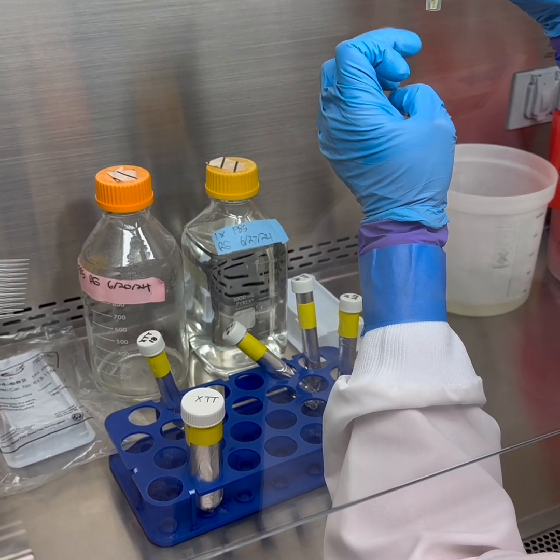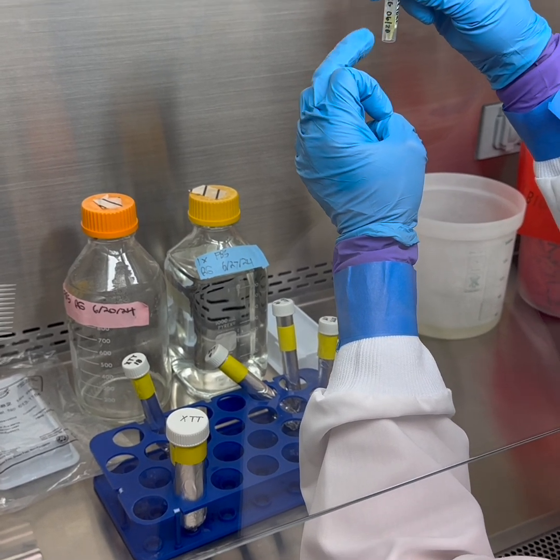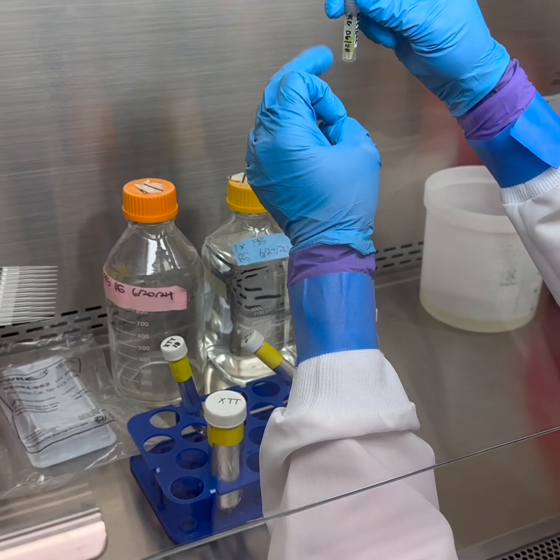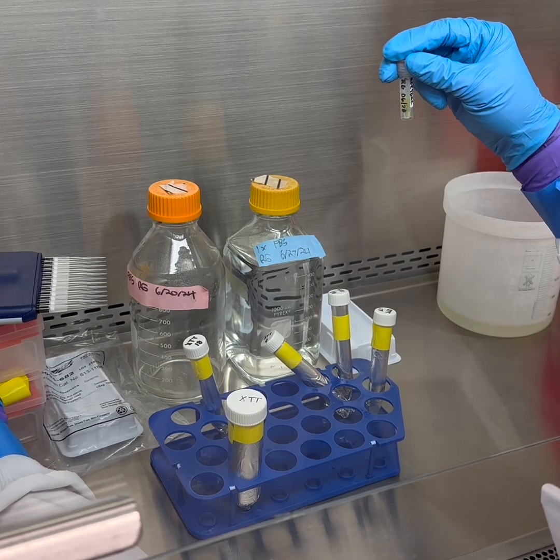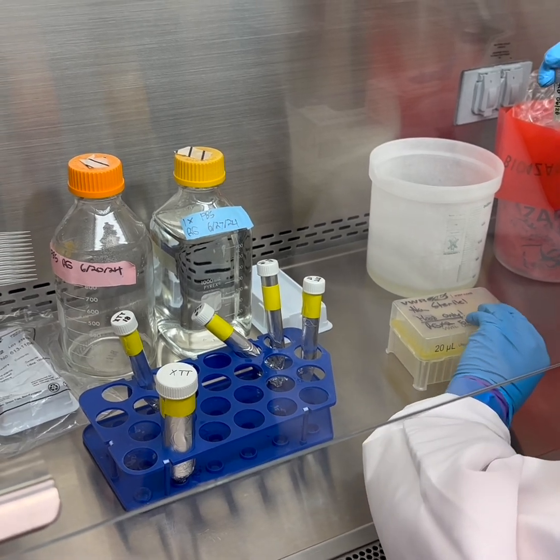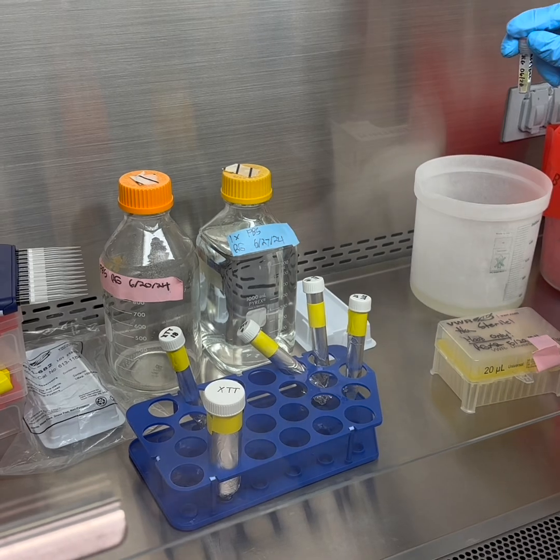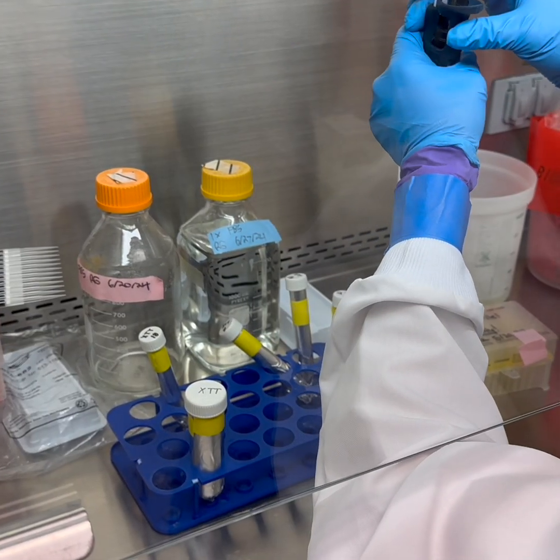It's just right there. I'm just going to mix it a little bit. Nothing too crazy. It should remain in solution though. Okay. Now we're going to take 4 microliters of this since we're doing 4 plates between Hannah and I.